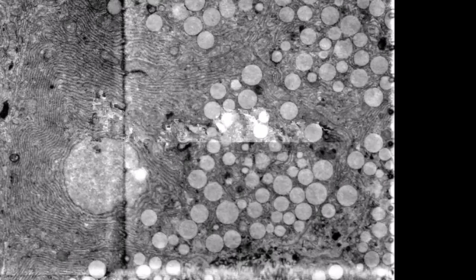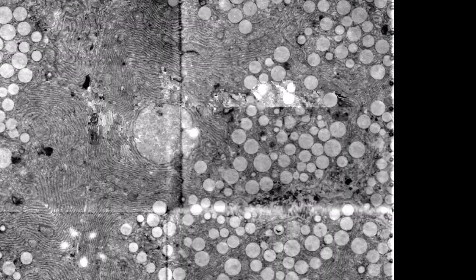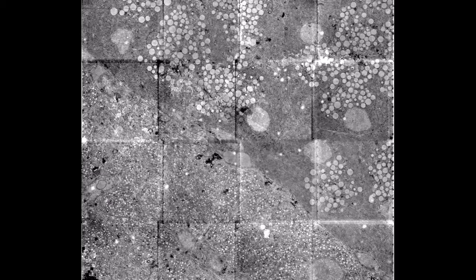So an electron image in one location, stage move, another image, stage move, another image, and in this way acquire a pile of images which would be stitched together. And the simultaneously acquired fluorescence image should be overlaid on this to have a large area correlative image acquired simultaneously and stitched together. So this is the correlative image that you see.